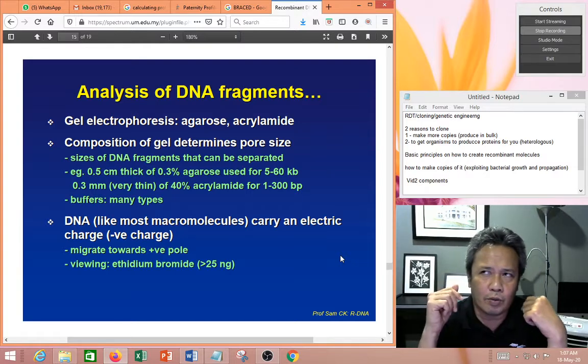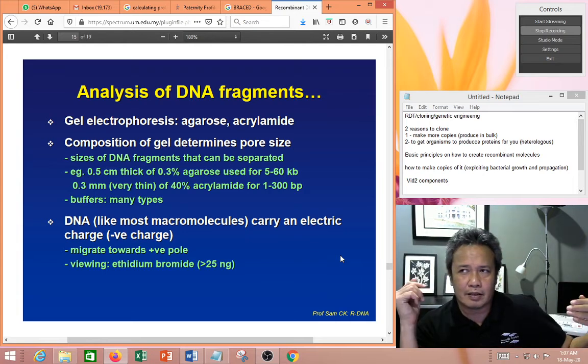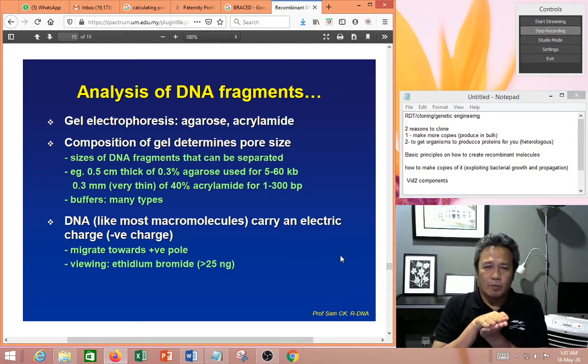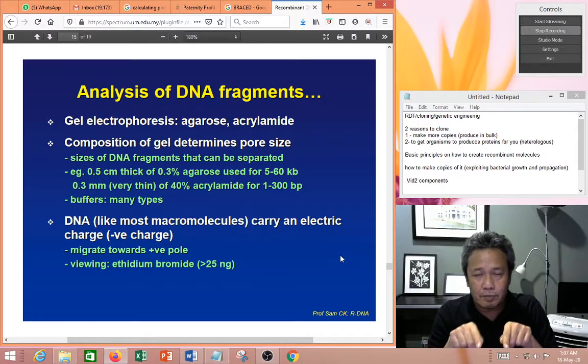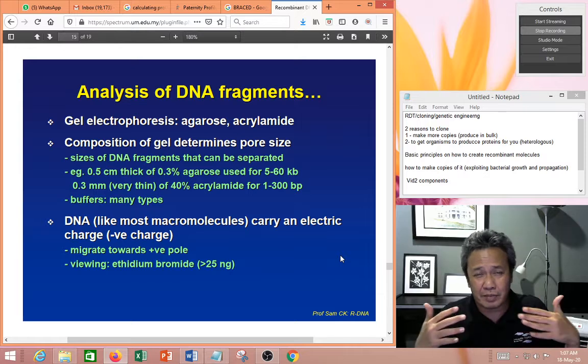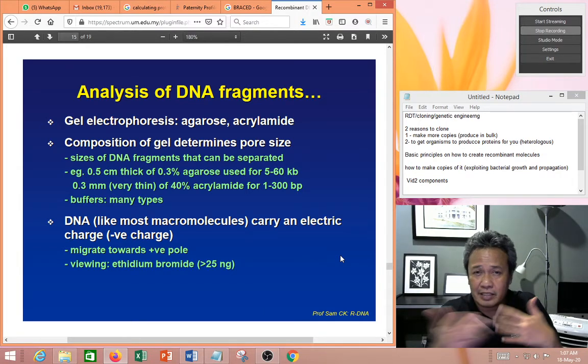Now, how does it work to resolve DNA? Because your DNA will move through the pores. You'll find that longer fragments will take longer to move, will be more difficult to move. Shorter fragments will be very quick to move, correct? I mean, it's simple logic.